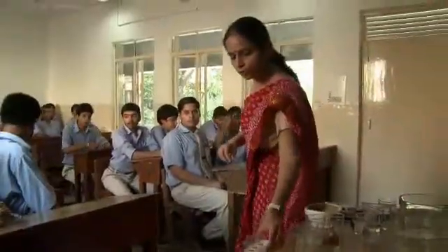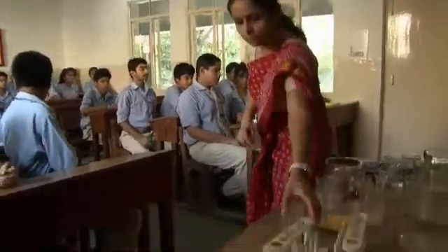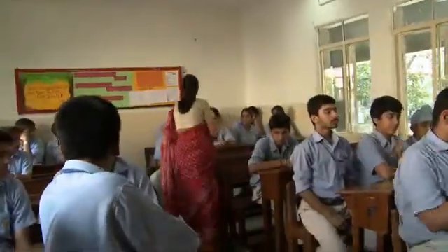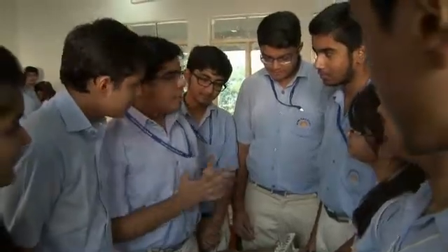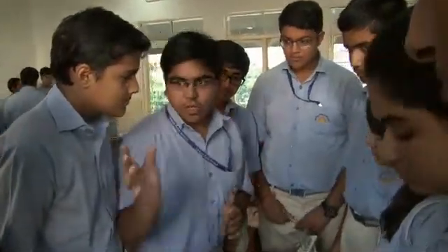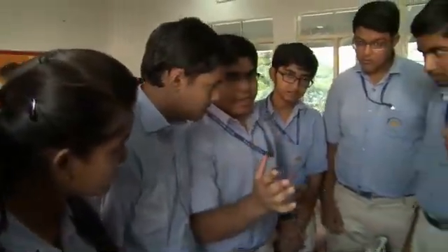Okay, now for group number 1, these are your samples. The teacher hands out a set of samples to each group so that they can analyze levels of acidity with their indicators. Weapon, you are going to tell us how the beetroot indicator is formed. Japsivat and Kirti, you will note down all the observations. Bhavna, Avleen and Akhil, you will test various samples, and at the end, you will give the feedback.